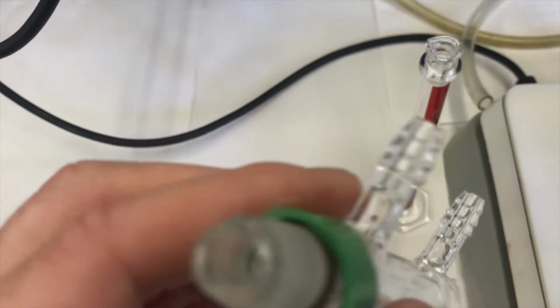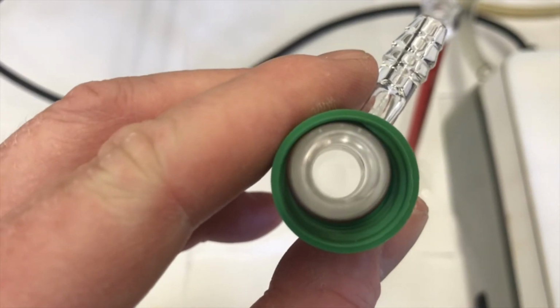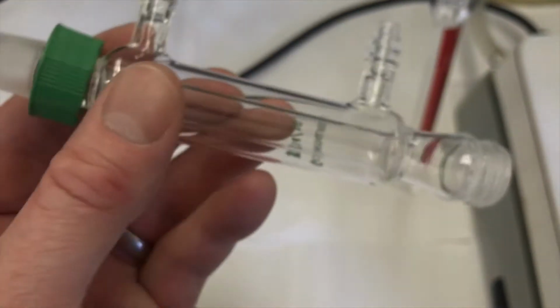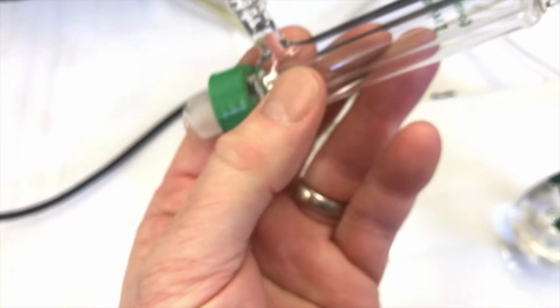And if you look through here, you see it's just a straight shot. The inside of this will have no contact with the water. The water is just jacketing that tube on the inside. So the water will be able to cool our vapors, but not have to get my vapors wet. So then I'll tighten this on. It's looking good.